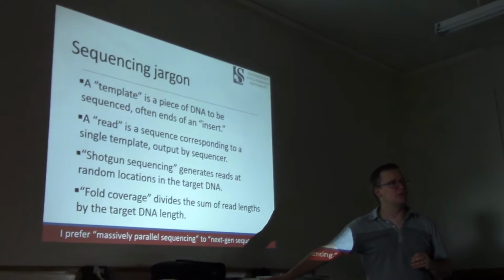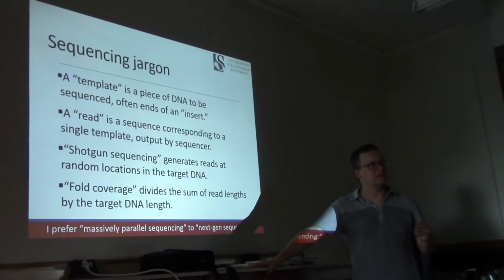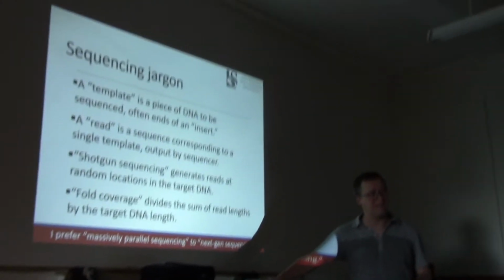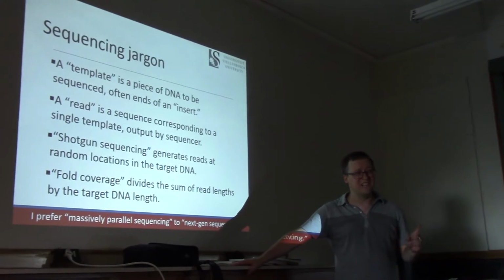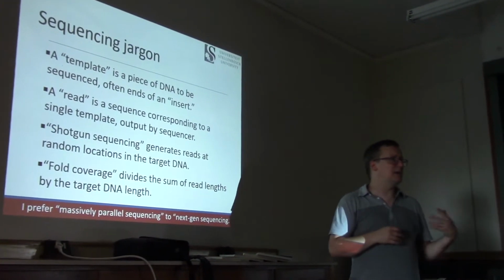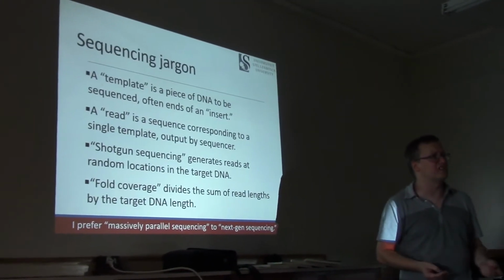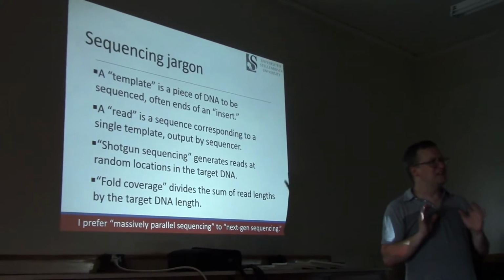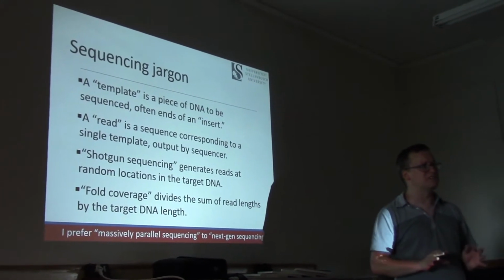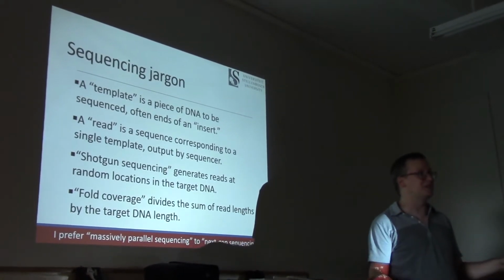Frequently, you'll hear the term shotgun sequencing. Now, whole genome shotgun is quite a different strategy than the kind of sequencing we were doing back when I was in grad school. I was in grad school in the late 1990s, and my lab was associated with the genome sequencing facility at the University of Washington. They had a very different notion about how to do sequencing back then, and the reason was sequencing was very expensive. You couldn't just sequence everything you wanted to do.